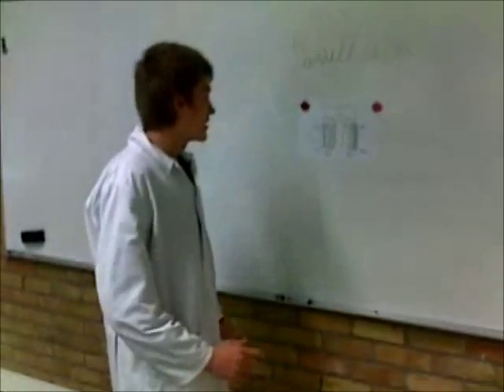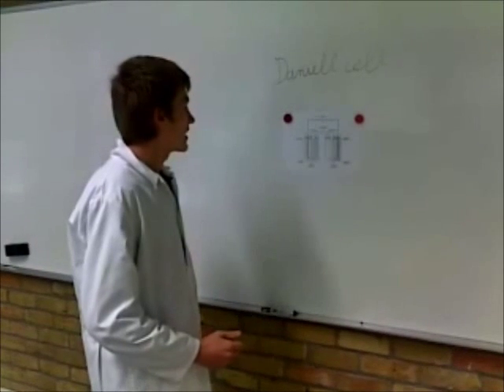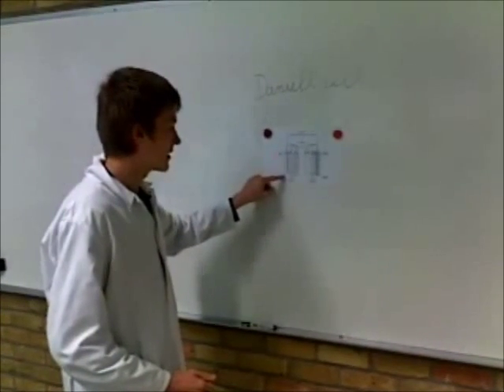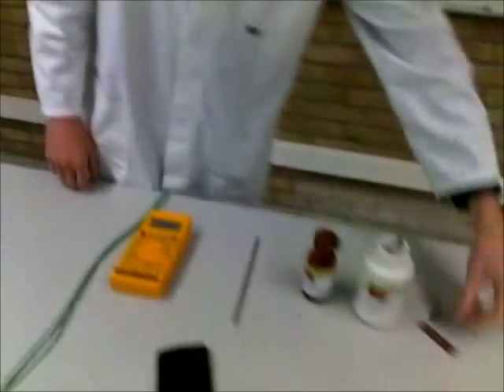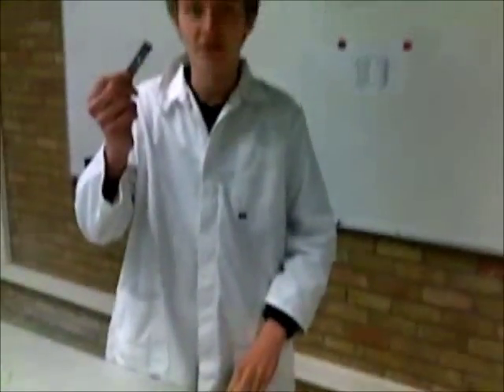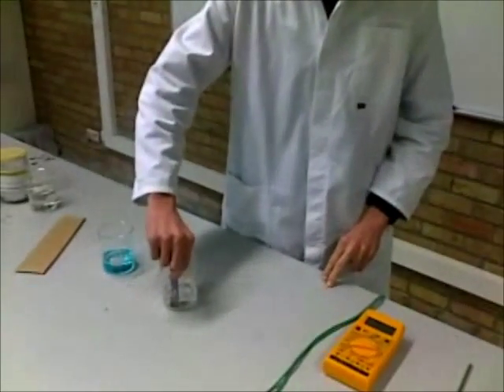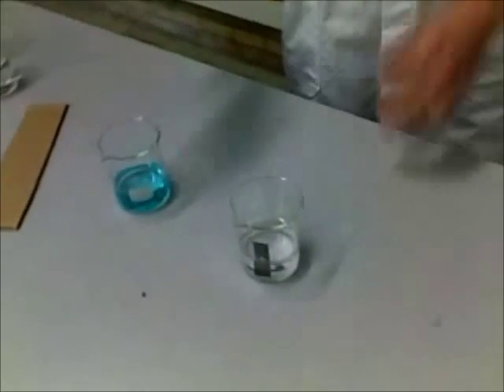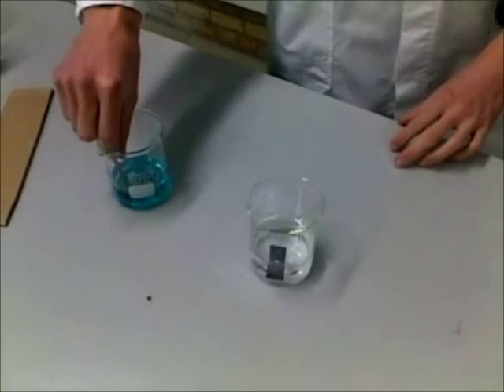And now to close your circuit, first you have to put a zinc electrode in a zinc sulfate jar. So just take a piece of zinc and put it in. Take a bit of copper and put it in the other one, as to be seen here.